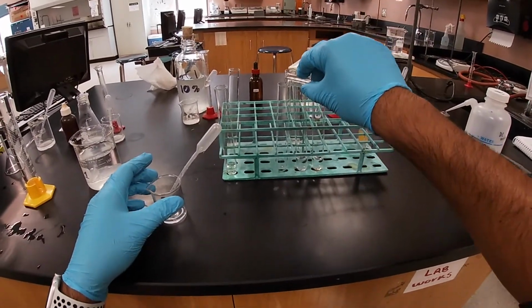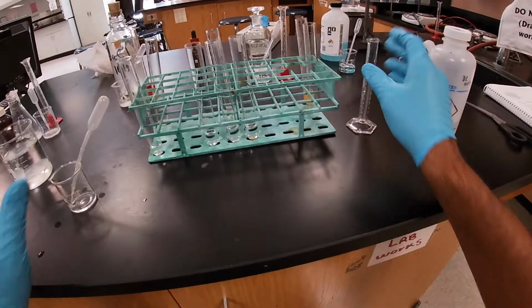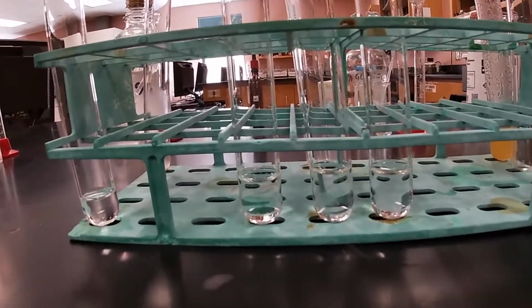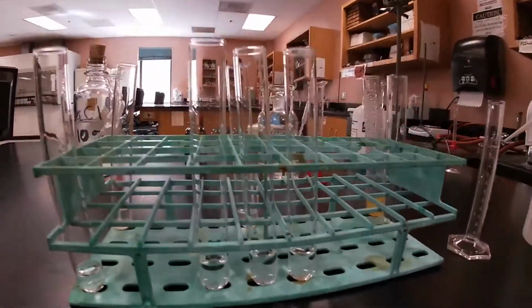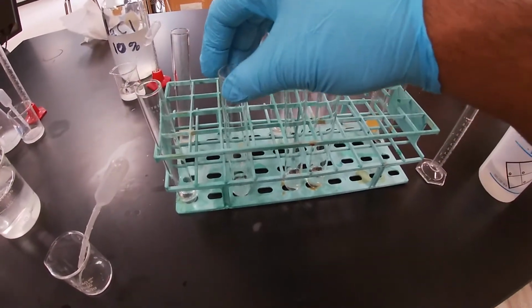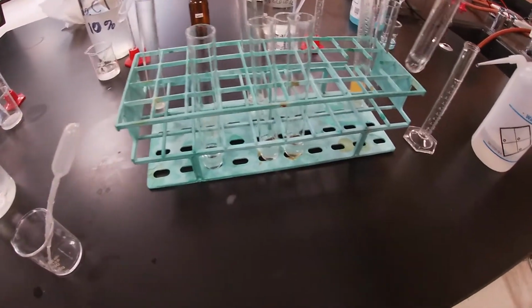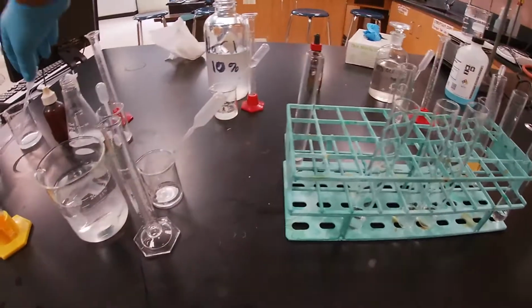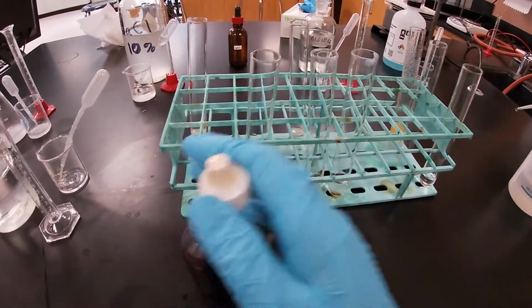Gonna put in our last test tube, and like I said, we're gonna do the following 3 tests. More or less, we got our test tubes going on, and we're gonna do our 3 tests. As you can see, we got our 3 test tubes with our initial solution immediately. What we're gonna do is test it first by adding a couple of drops. So let's go ahead and put this one over here in the corner. Let's put this over here. Let's bring up the iodine, whoops. And we're gonna test the iodine first, initially.